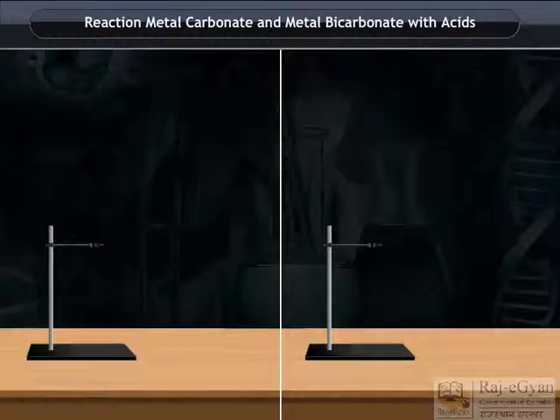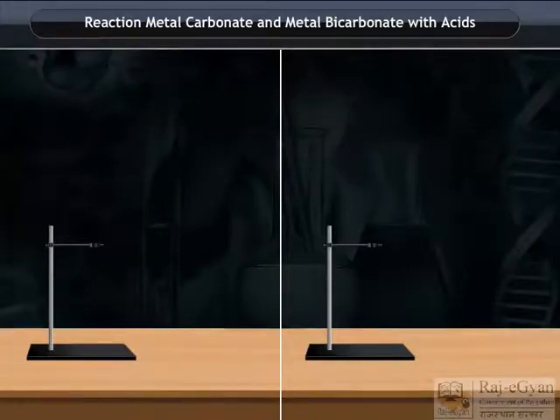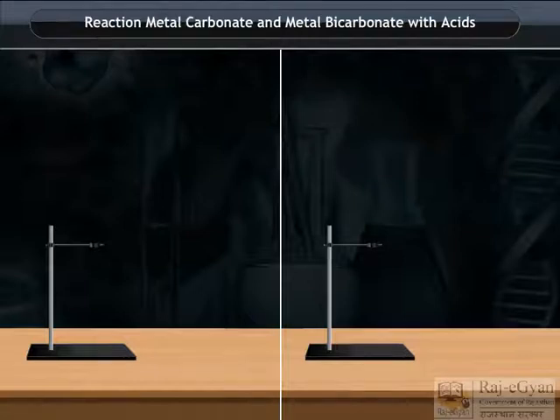Reaction of metal carbonate and metal bicarbonate with acids. Let us explain with the help of an activity.